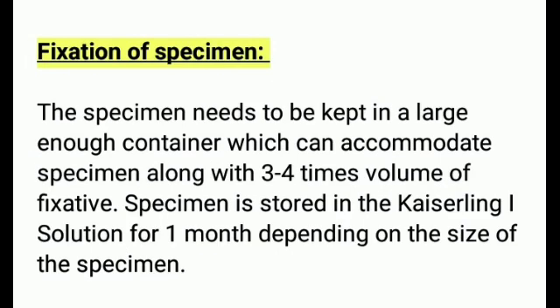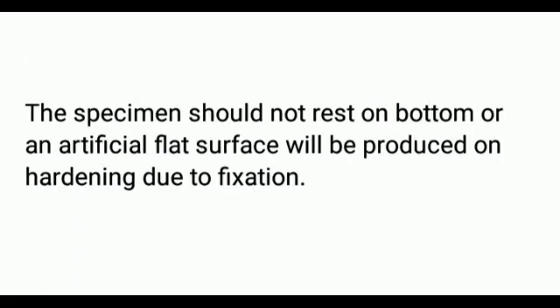Fixation of specimen. The specimen needs to be kept in a large enough container which can accommodate the specimen along with 3 to 4 times volume of fixative. The specimen is stored in the Kaiserling I solution for 1 month depending on the size of the specimen. The specimen should not rest on the bottom, or an artificial flat surface will be produced on hardening due to fixation.